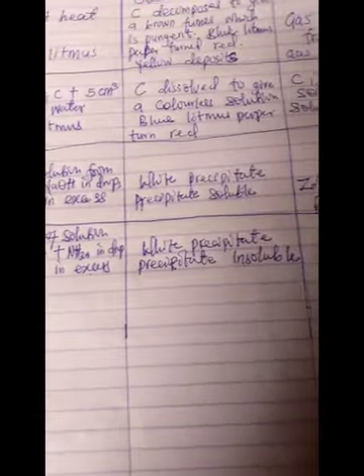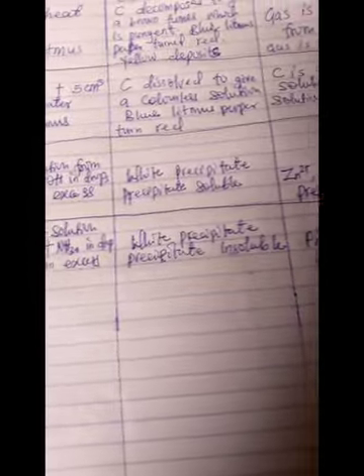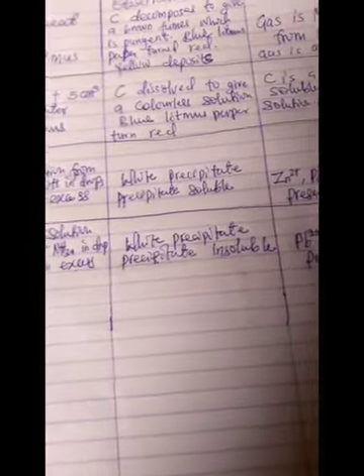Good. Let's go to the next one. I think we are making good progress. So let's consider the last part here. We have identified the ions, we are narrowing down. Now what we have is just lead and aluminum. Before they were three, but now we have narrowed down. So let us now confirm which one is present, whether lead or aluminum.